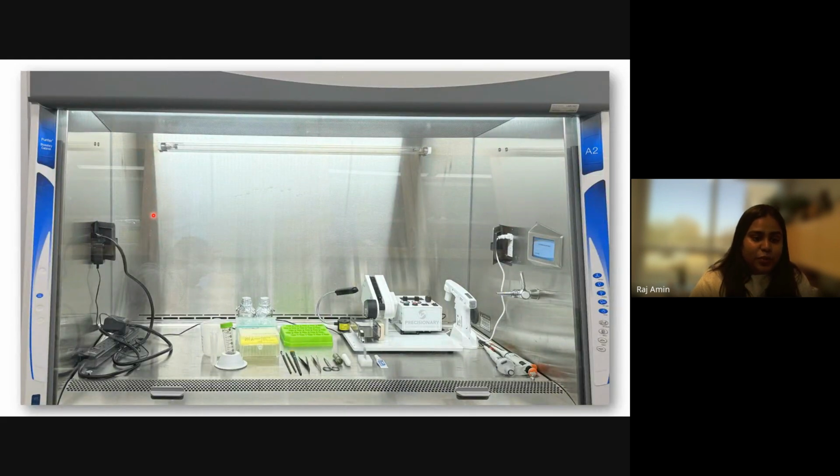This is the setup that we have in our lab. We have set up the whole experiment of organotypic slices in a BSL hood, where beginning from the left, these are the instruments that we use for dissection. We have specialized paint brushes, which we have gotten just for isolating and collecting the brain slices from the tank. Then followed by that, we have different buffers available, which we oxygenate inside the hood to maintain the respiration of these organotypic slices.